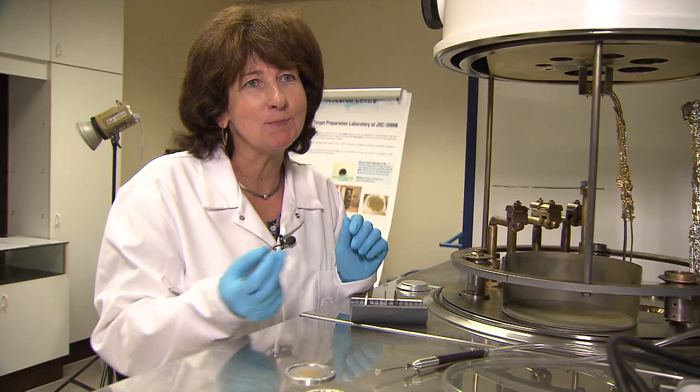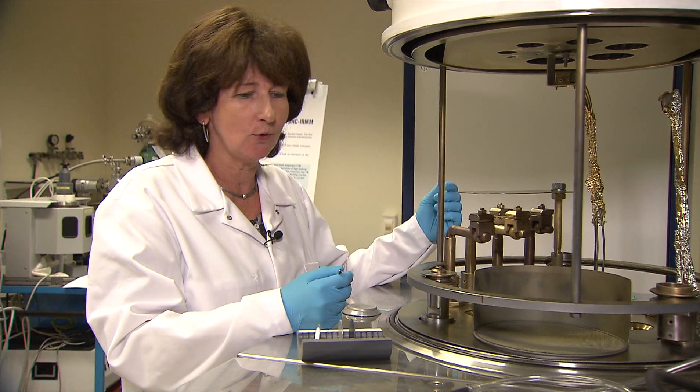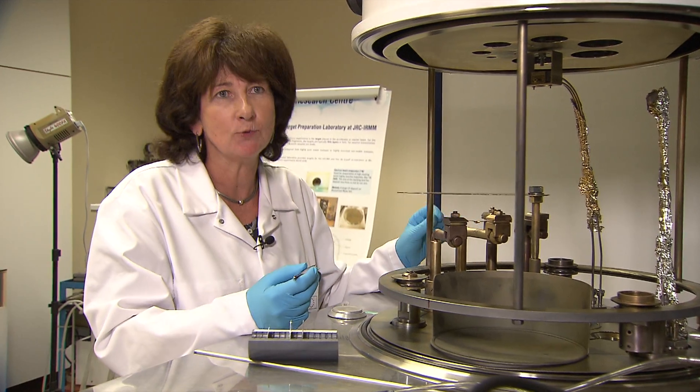These layers are produced by vacuum deposition. Here you can see the vacuum evaporator. In this case, the gold material is placed in the tantalum crucible, which is connected to a power supply.